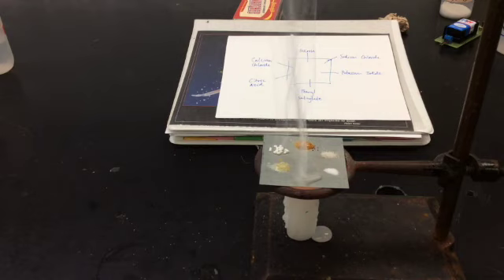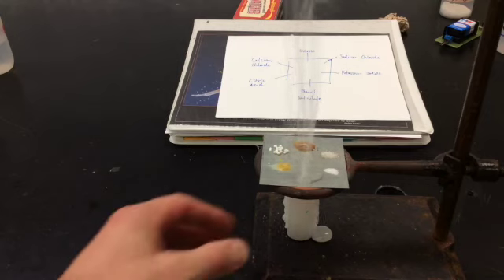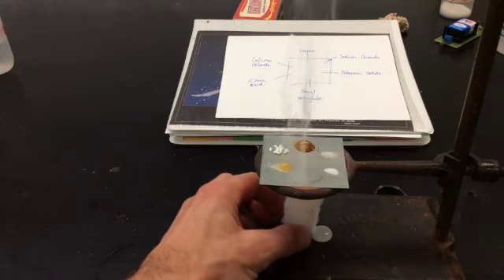It's kind of nice. It smells like toasted marshmallows or roasted marshmallows right now from the sucrose. All right, we're going to take our candle out now.